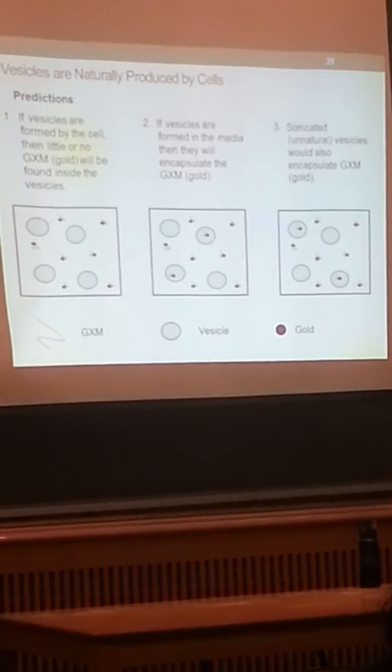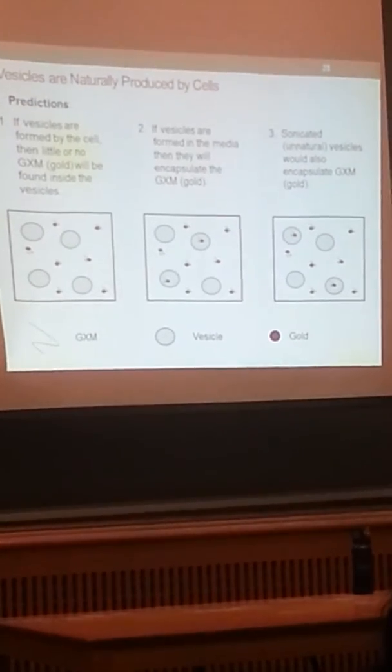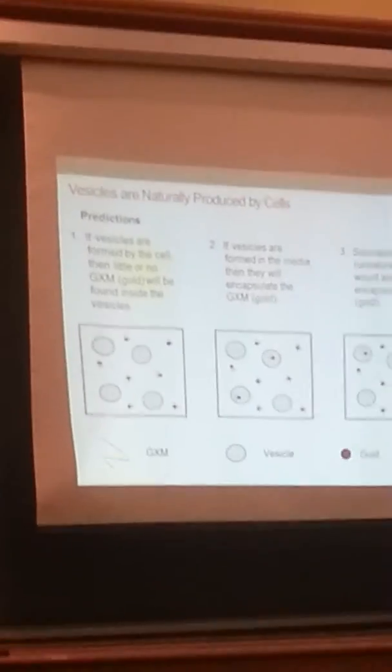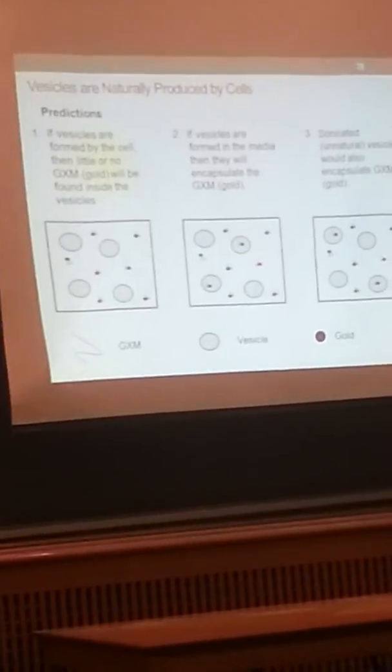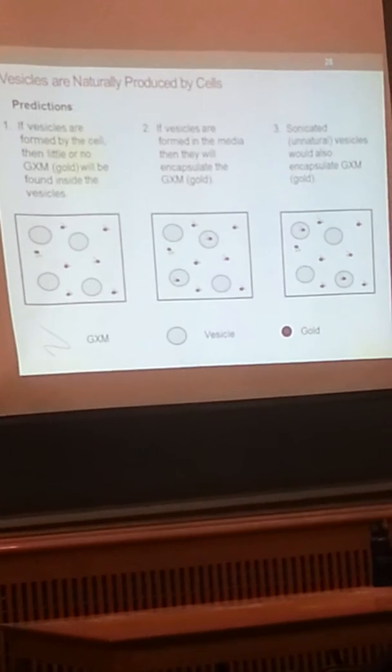But as a control, I also utilized a vesicle prep that I sonicated. So I disrupted all of these vesicles to make fake vesicles, or mimic vesicles, that would be forming in the media.